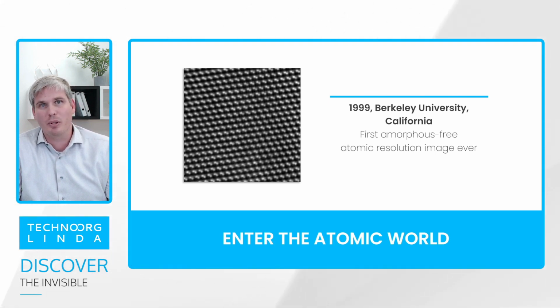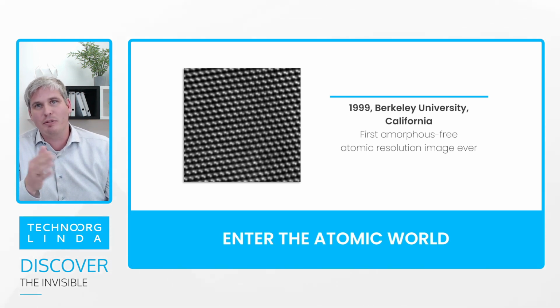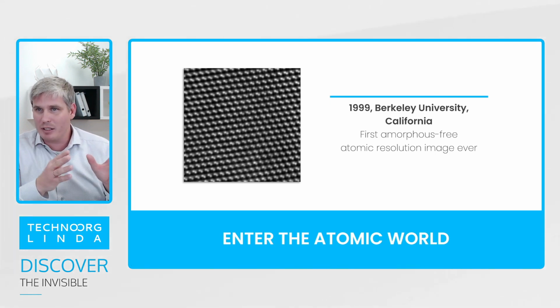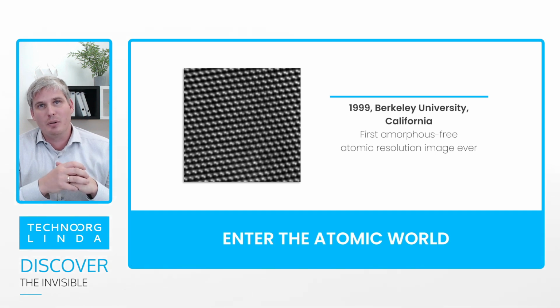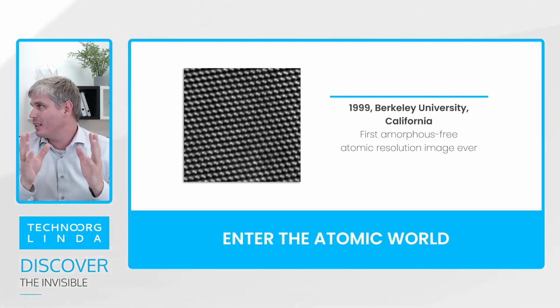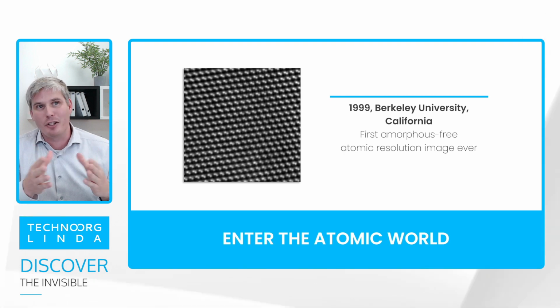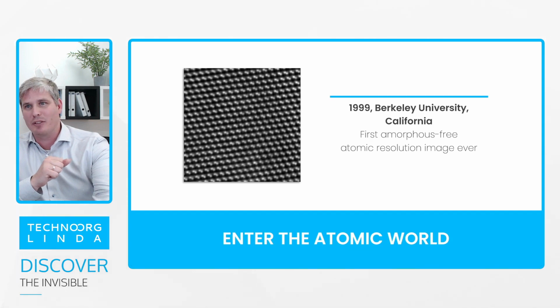And why was it so important? Because that was the very first chance to remove all those amorphous and destroyed layers caused by the mechanical preparation or even by the high energy argon ions, which covered this kind of detailed structure. So from that moment it was a new possibility given to scientists to evaluate completely amorphous and damage-free atomic structures. Basically a new era.